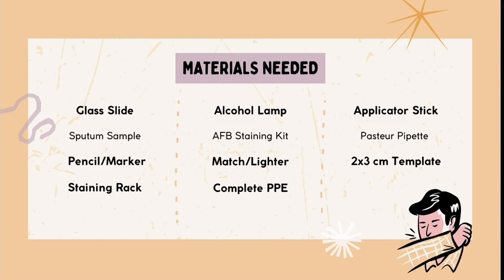According to the American Centers for Disease Control and Prevention, at least 3 consecutive sputum samples, each collected at 8 to 24-hour intervals with at least one sample being an early morning expectorate, are required for diagnosis. And please take note of your Bartlett's criteria.